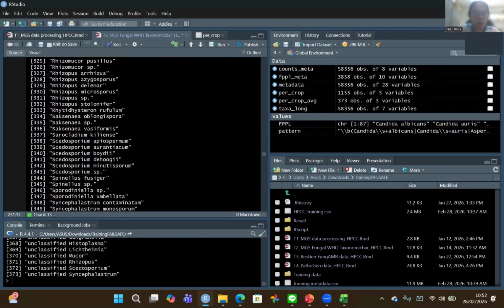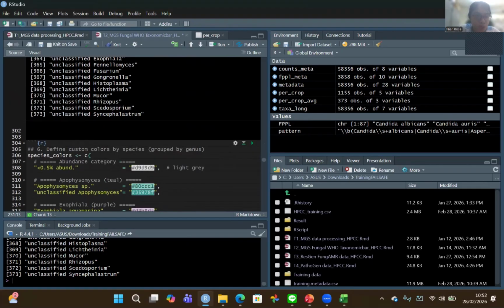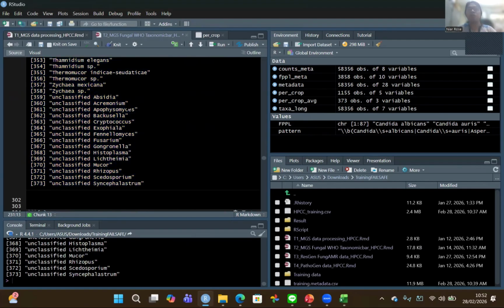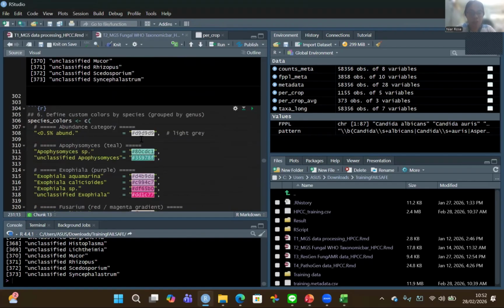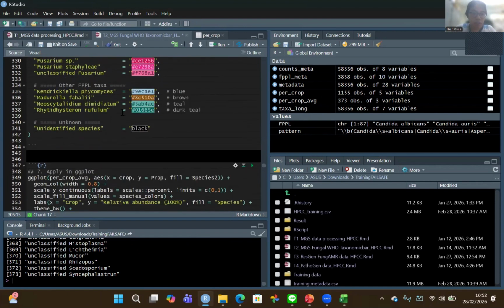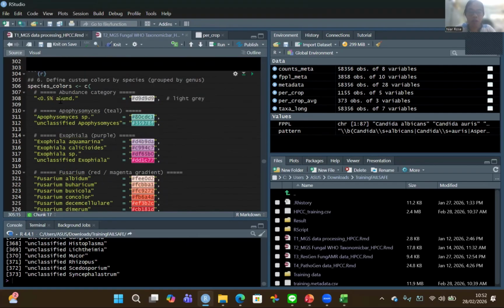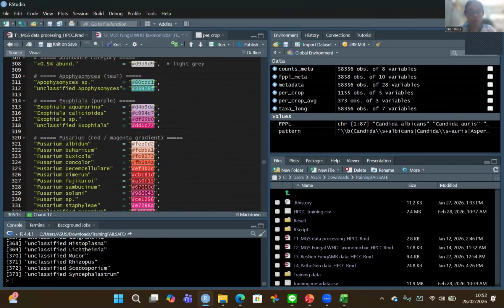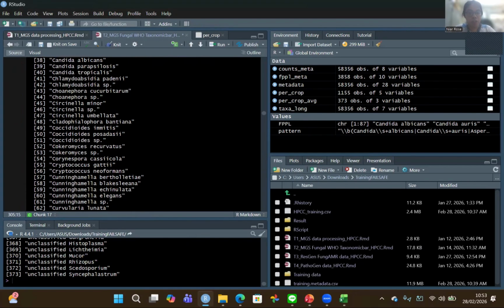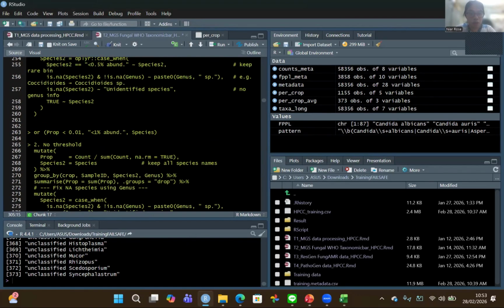If you use these 373 species, it will give you a lot of work if you want to visualize them, because for the next command line, you need to define the custom color, which you need to write by yourself to give a more specific color for each species, which is not really good for visualization, and also gives you a lot of work later.